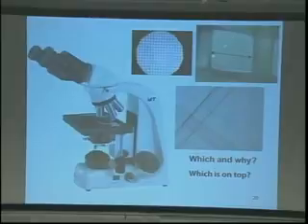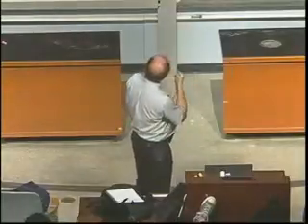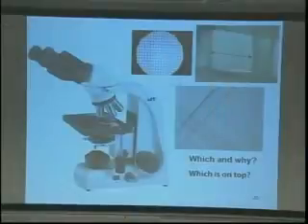So if, in this case, can you see the number of ruler marks that fit there? You're going to read that number? It's 40. So if that's the case, 100 micrometers divided by 40 spaces is what? 2.5 micrometers per space. If we change the magnification, the nylon mesh does not change. The edges don't change, but the distance they represent does change. But it's fixed because we only have 4 powers here. So once we calibrate these objectives once, it works every time from then on, right? Because those lenses are fixed in place. Is that clear? Any questions?